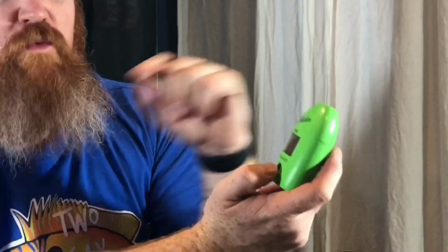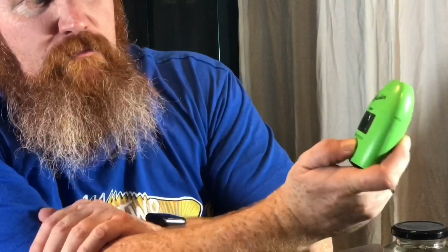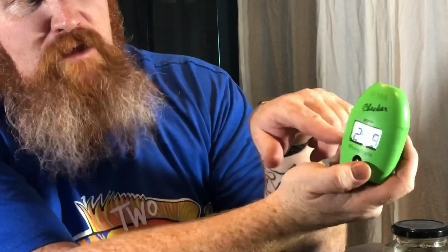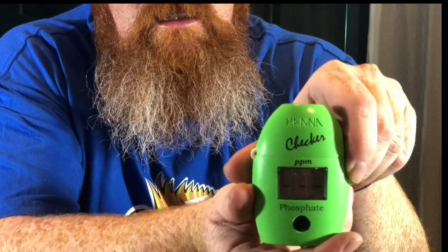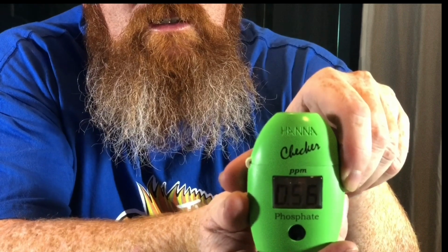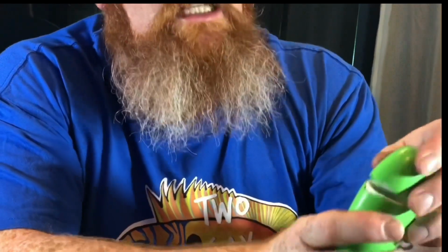Now, trick with this one, and it's not the same with all of them, but this particular phosphate checker, you need to hold that in, and then it comes up with a countdown timer for 3 minutes. So you put that aside and wait your 3 minutes. 4, 3, 2, 1. What's it say, Darren? 0.56. So our phosphate's currently sitting at 0.56. Is that good or bad, Darren? It's high, but coming down, there you go.